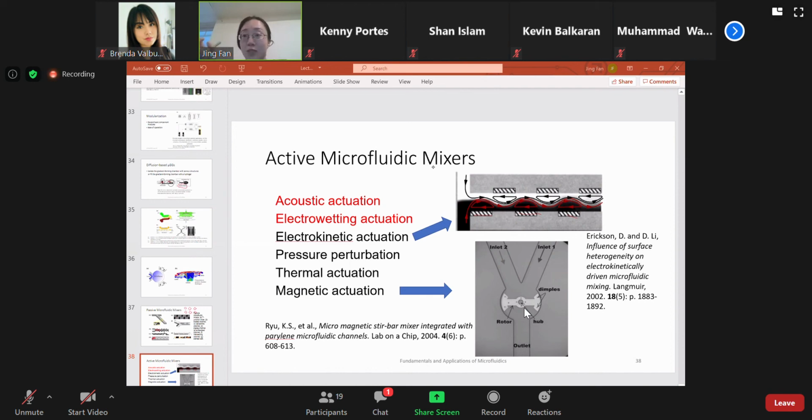they have many gas bubbles, air bubbles for example, in the channel. When you heat up, those bubbles can swell, and when you cool it down, they shrink. This kind of swelling and shrinkage of bubbles in the channel can also help induce the mixing or mass motion of liquids surrounding the bubbles. So there are two different types of mechanism for using thermal actuation, by taking use of the density change of liquids or the expansion and shrinkage of bubbles in response to temperature change.